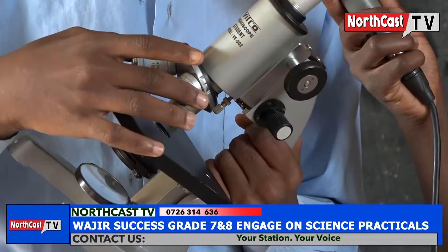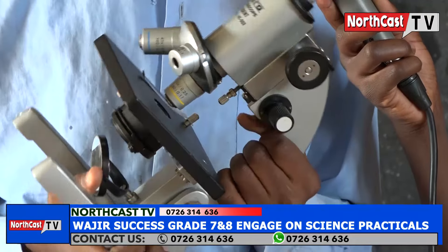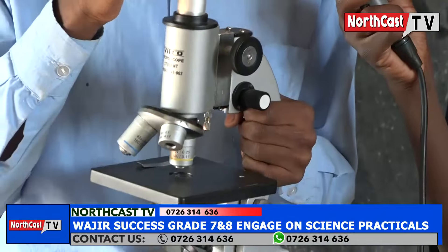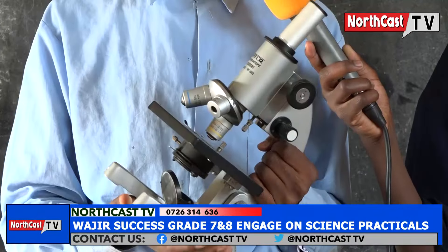The other one is the objective lens. This is the objective lens. The objective lens is used together with the eyepiece to bring out the desired magnification.